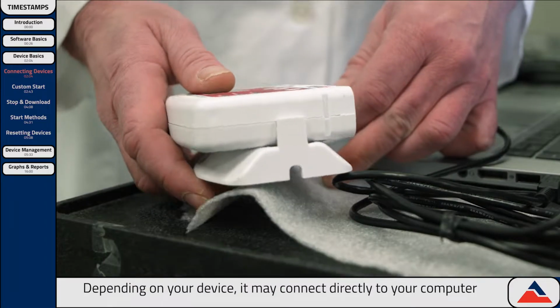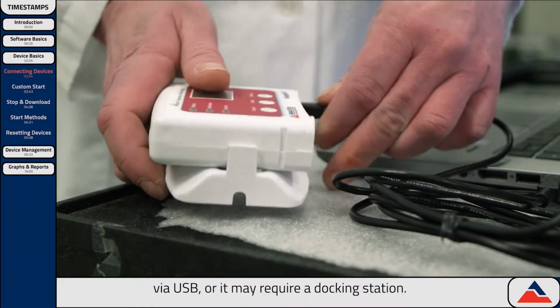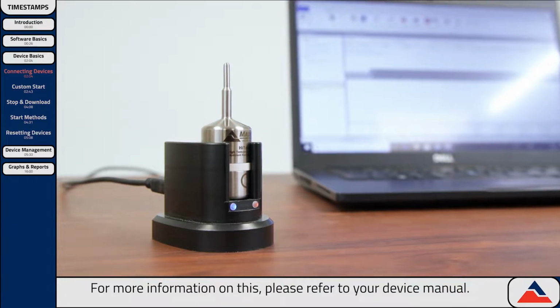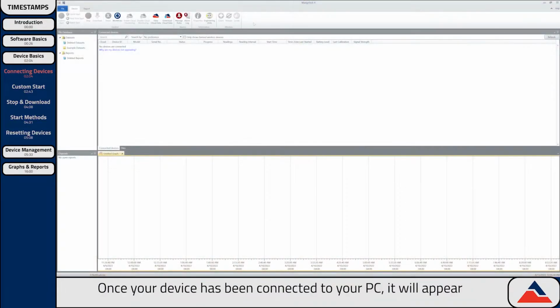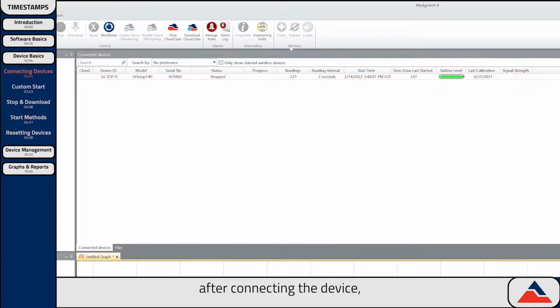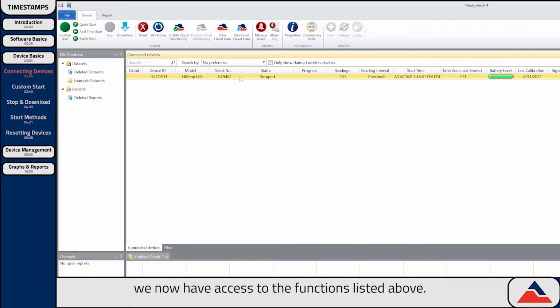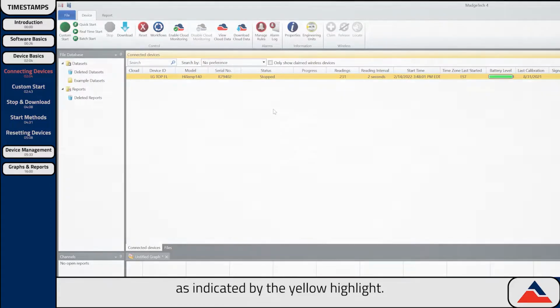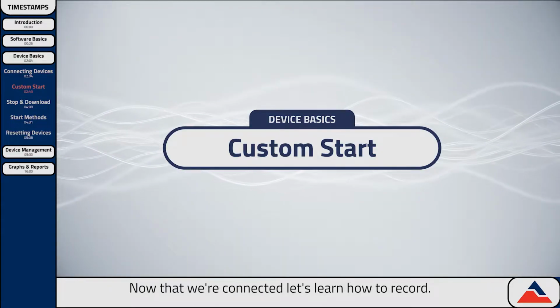Depending on your device, it may connect directly to your computer via USB, or it may require a docking station. For more information on this, please refer to your device manual. Once your device has been connected to your PC, it will appear automatically in your control panel under Connected Devices. You'll notice after connecting the device, we now have access to the functions listed above. If multiple devices are connected, make sure the correct device is selected before adjusting any settings, as indicated by the yellow highlight. Now that we're connected, let's learn how to record.